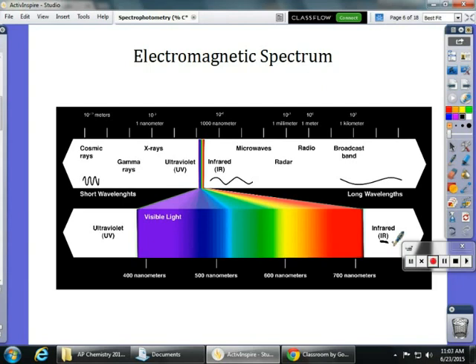You would look at them because they have a distinctive color. Maybe iron ions. Maybe we're looking at food dyes, or maybe indicators like crystal violet. We'll look at one lab where they actually have strong absorbance in this range that allows us to analyze them. So you couldn't use this to look at something like sodium or potassium ions that don't absorb strongly in that range. If they're not going to absorb light, then it's really not possible to use spectroscopy to measure their concentration.